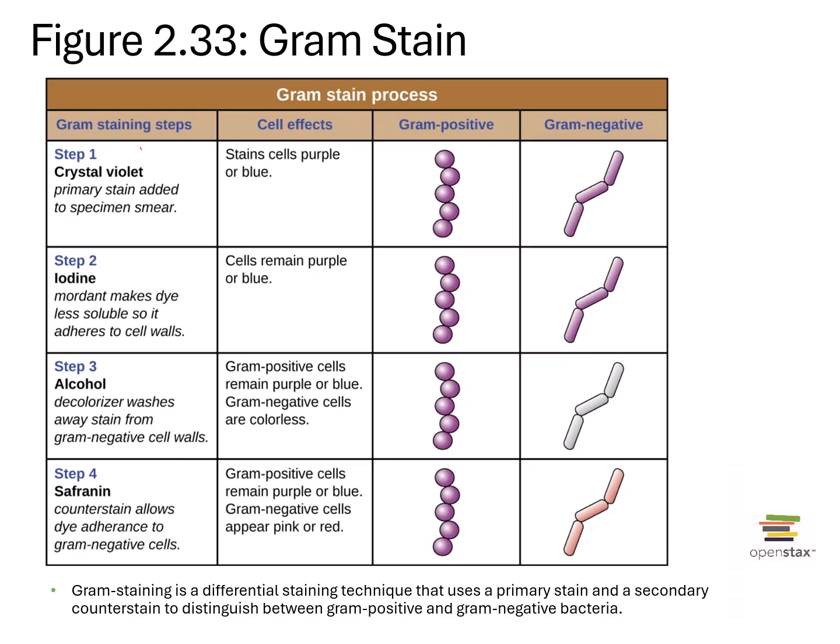The gram stain begins with our primary stain, crystal violet, and crystal violet is a basic stain that binds to all cells regardless if they're gram-positive or negative. And that's because cells, remember, overall their surface is negatively charged, so the stain will bind to the cells.